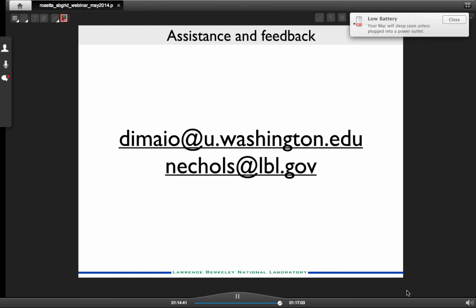Sorry, can you repeat the question? How about the Rosetta running with the glycoprotein? How well does it work with glycoproteins? Oh, yeah, it doesn't right now. That counts as ligands, basically, and we don't have a way to deal with covalent attachments. So if you were going to refine a glycoprotein, you would basically have to take the glycosylation sites off and add them back later. That's a little beyond what it can handle right now. I suspect somebody somewhere probably has plans to deal with this in the future, but I don't know what the current status is.